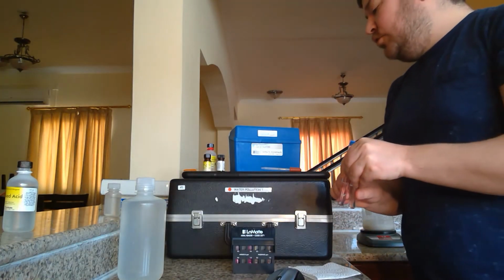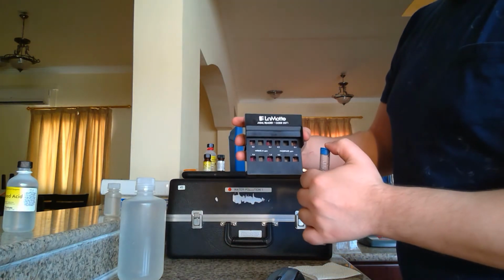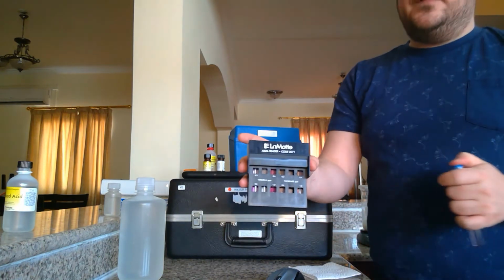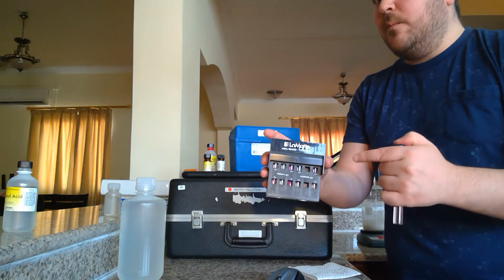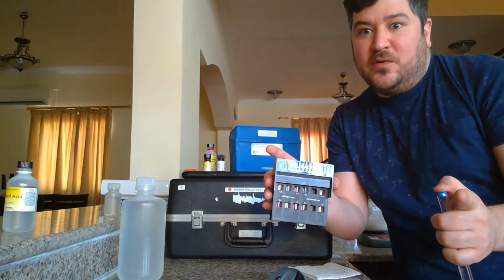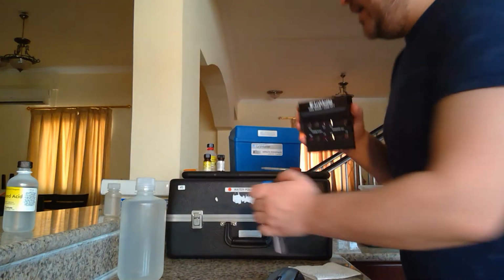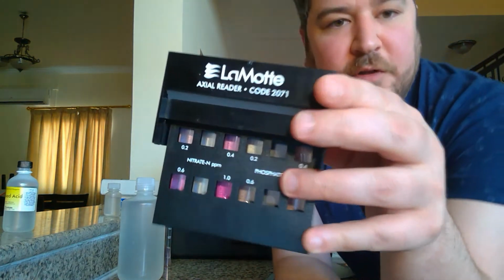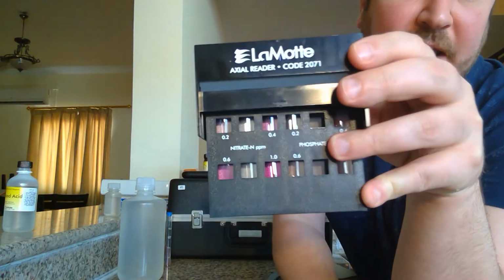So now what I do is I put it in this reader and compare it to the levels of parts per million. We go from 0.2 to 1, and it does say in the procedure that the result I get, I will multiply it by 4.4, which I'm going to get you guys to do. Pretty easy. In here, I just have the regular sample. It says not to put this into direct sunlight. I have a lamp on in the background, but I'm not going to do any extra lights.